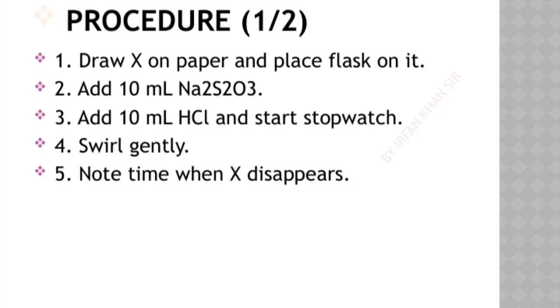Then, add another 10 milliliters of hydrochloric acid, HCl, and immediately start your stopwatch. It's important to start timing right when you add the acid, because that marks the beginning of the reaction. Now, gently swirl the flask to mix the solutions well.